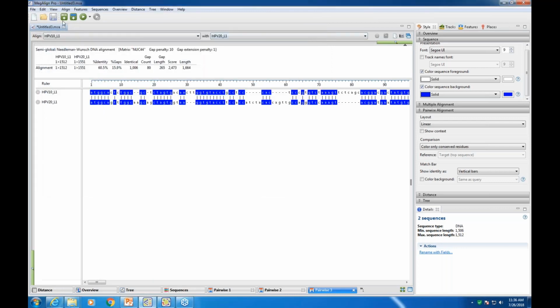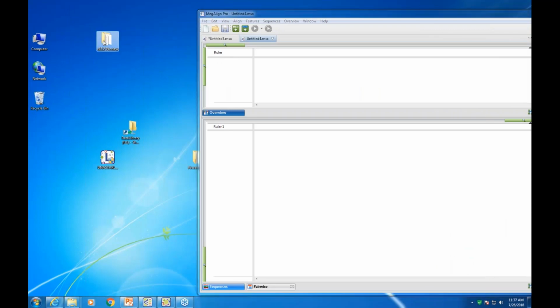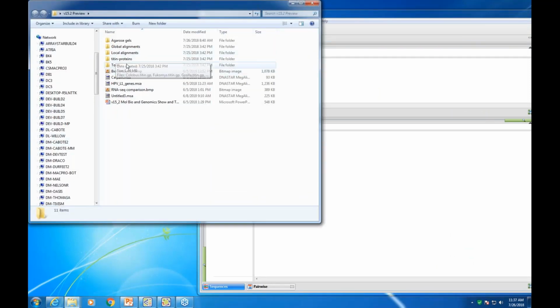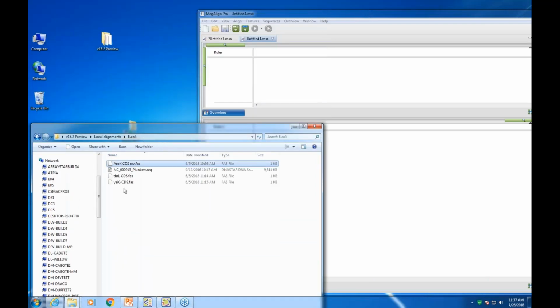We've got a couple minutes here, so I'm going to show one other type. In this example, it will be aligning small sequences to a big sequence. So in this case, CDSs to a bacterial genome. I'm just going to move this aside here and load the sequences in. This is some E. coli, and here are some sequences.